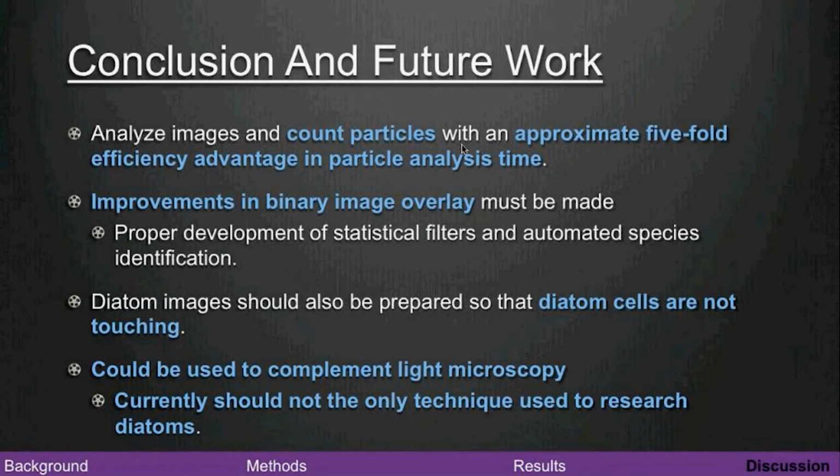I was just curious about a couple things. One was, it seems like all your slides have single diatoms, like they didn't happen to sit on top of each other. Is that selectively done by how the slides are prepared? That is one of the issues the program can run into. As I mentioned for future work, preparing the diatom valves so they're not touching is key. If they're on top of each other, the software will only see the outline of the bigger diatom, so those two will be incorrectly processed as one diatom particle. That's one of the future works that we have to collaborate with the software developers on.